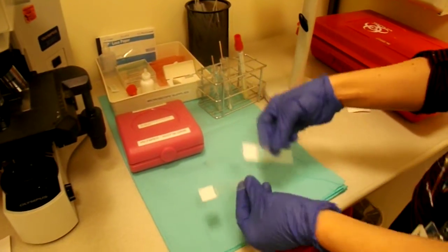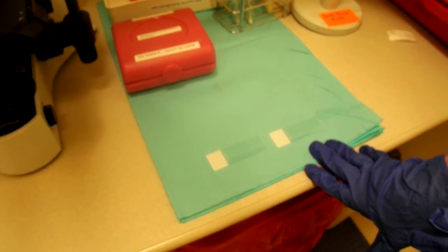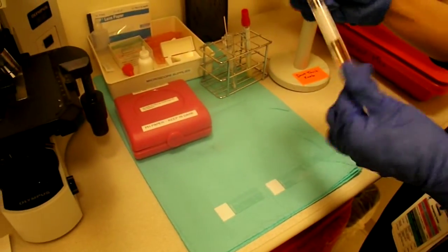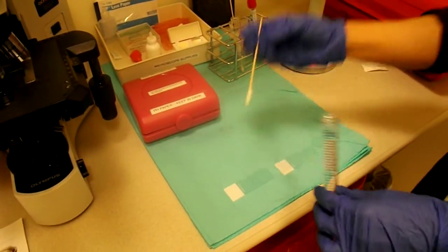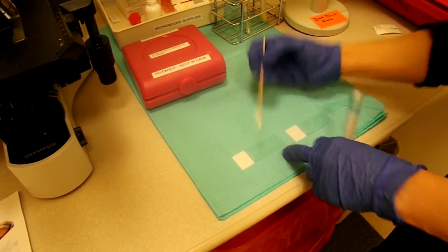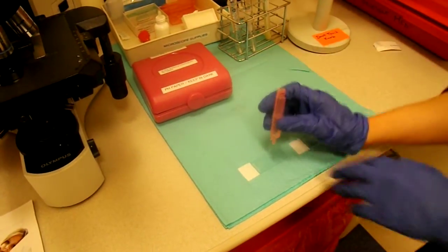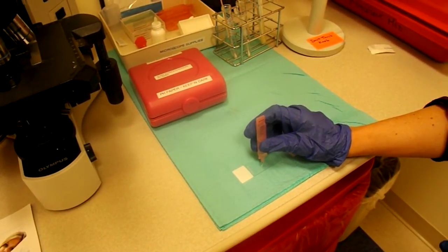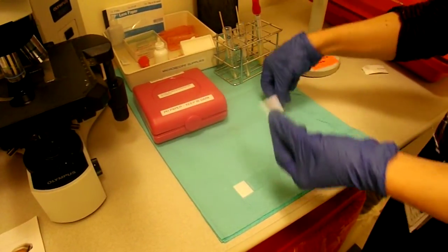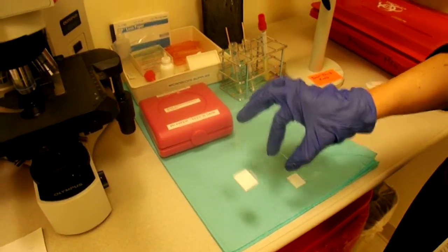Here are the microscope slides, and you're usually going to set up two, one for your saline prep and one for your KOH. If you have one that already has saline, these don't have anything on them now, but we'll test. You swab it on the slide like this, so you get a sample. If there's already enough saline on it, you might not need to add more. If there isn't, you should, and usually 1 drop will be fine, since you don't want to dilute your sample too much. Then you take a cover slip, which is here, and you put it on like that. So that's your saline sample.